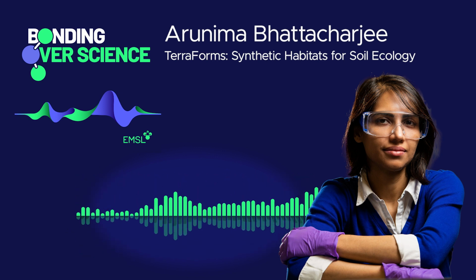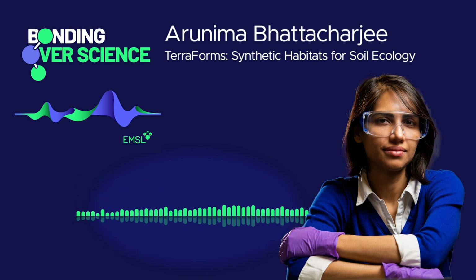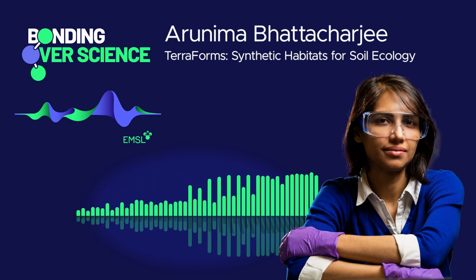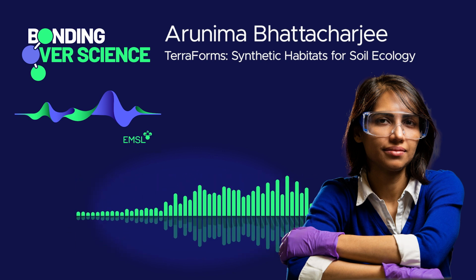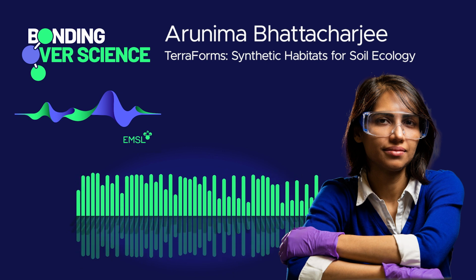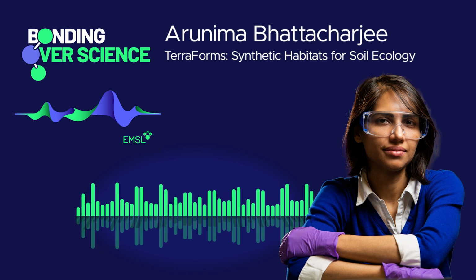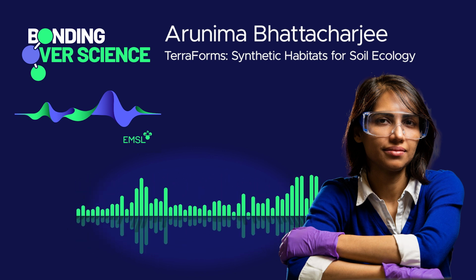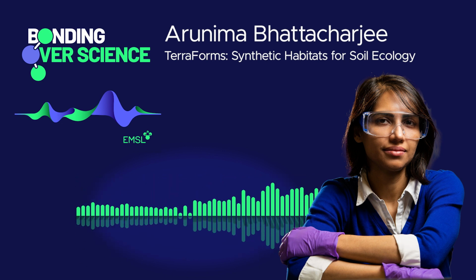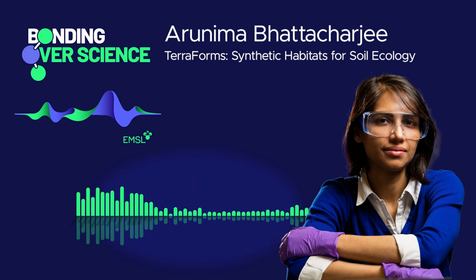They can extract the bulk biomass and do some omics, but our advantage is that all of our platforms are compatible with imaging mass spectrometry. So we can take a chemical image on these after the incubations are done. Most of these techniques are destructive. We are trying to figure out how we can, in the future, do non-destructive chemical imaging on these. We're not there yet. But the reason there is huge user demand is, I think, that we can get chemical maps, and that chemical and metabolomic information is extremely valuable for understanding mechanisms and interaction pathways between plant and microbe or microbe-microbe interaction, apart from just getting an optical image.